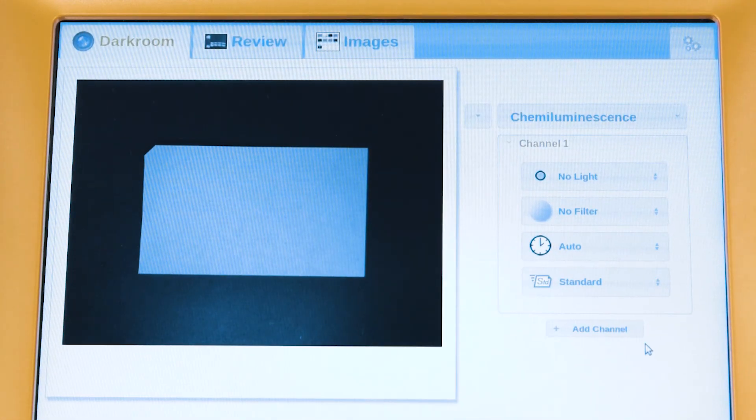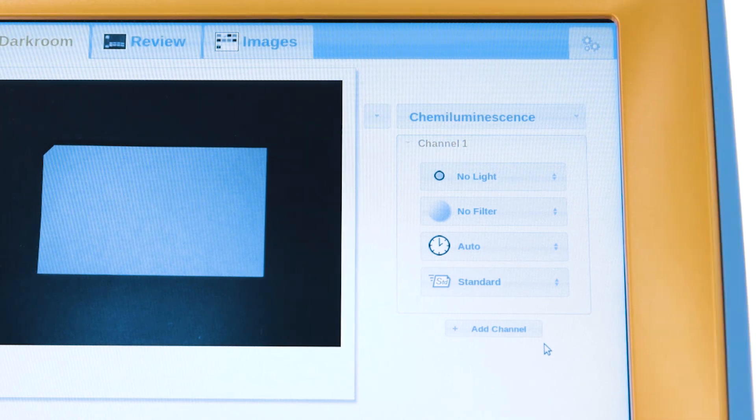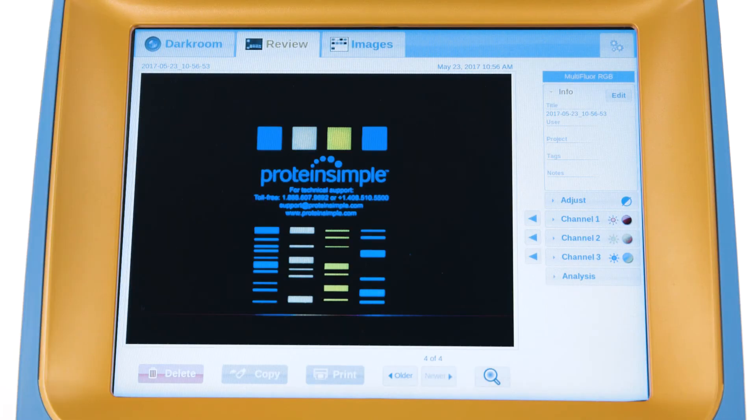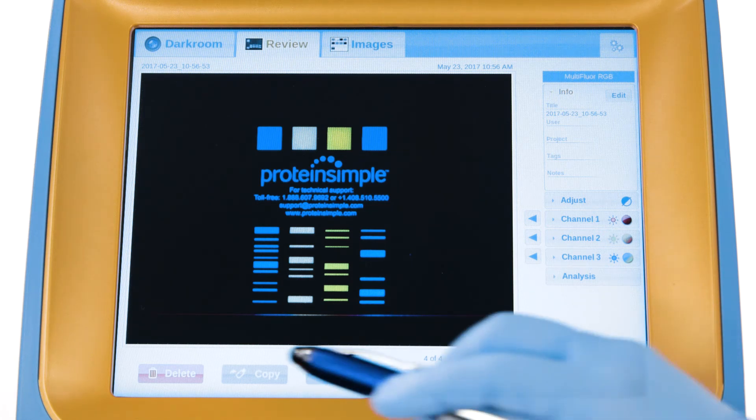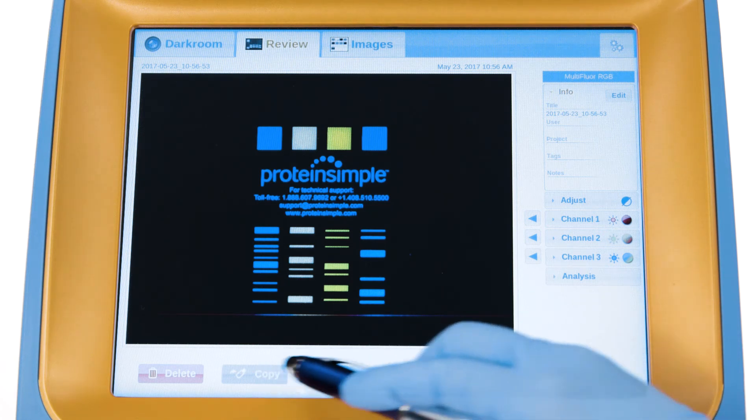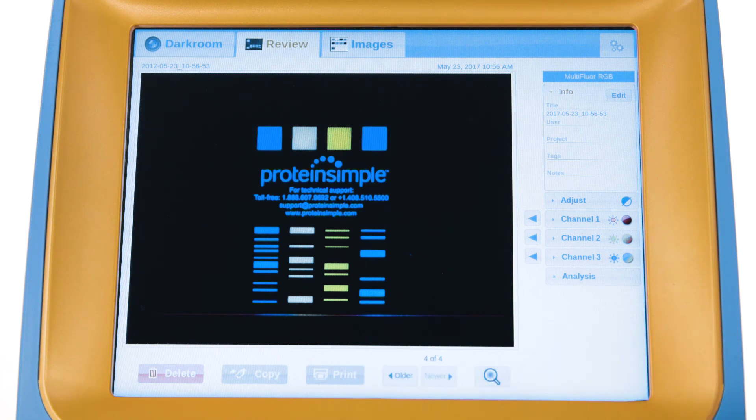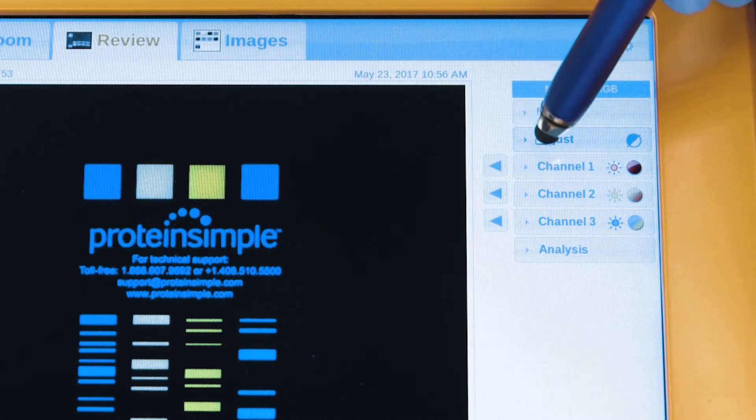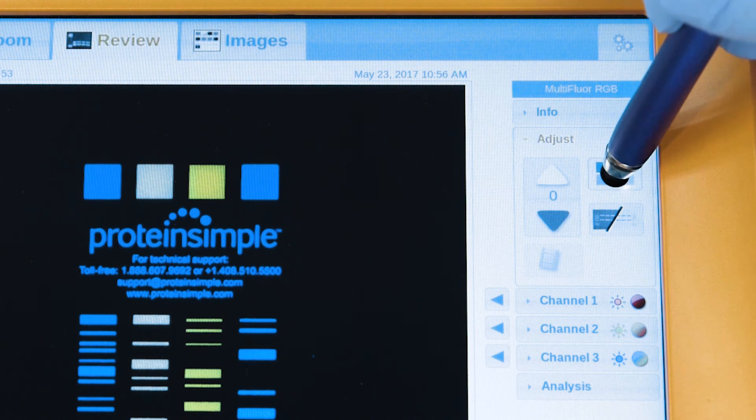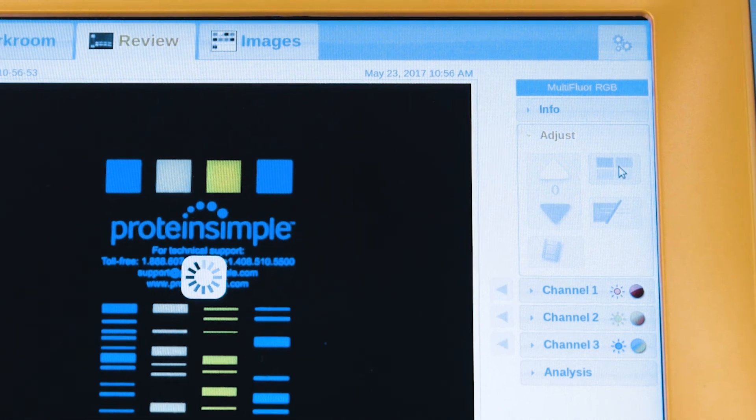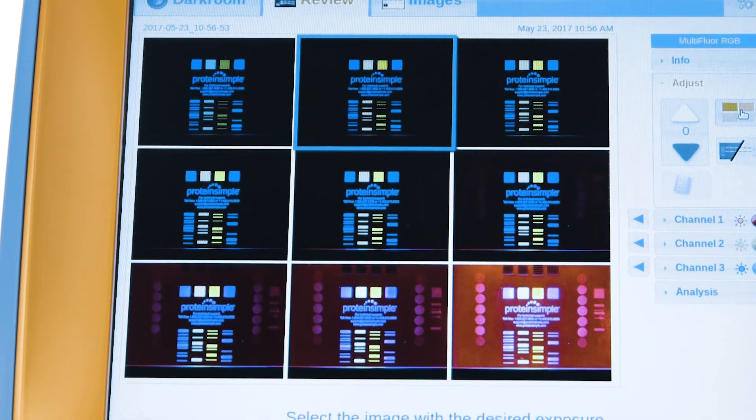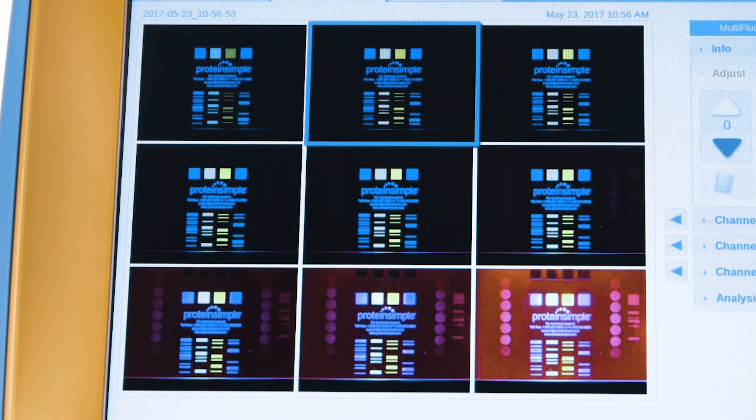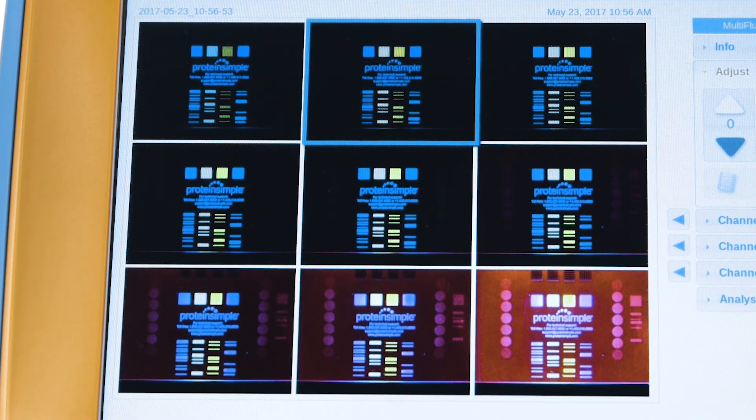Once an image has been acquired, the software takes you to the review screen. From here, the image can be downloaded or printed. Adjustments can also be made to the image, including a 9-contrast image view which shows the image at different contrast levels—a helpful tool when trying to detect particularly faint bands.